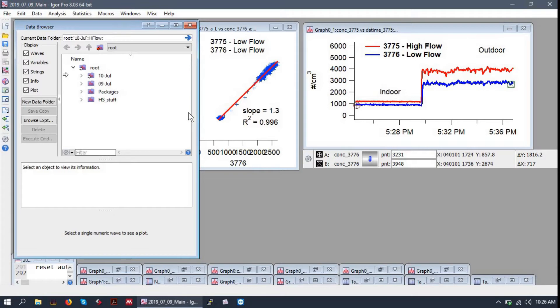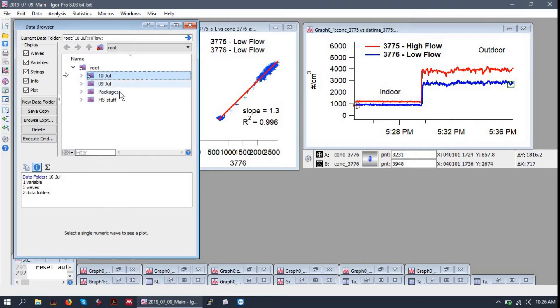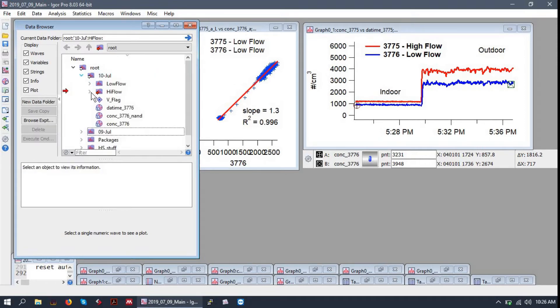We have our data browser, which is where all of our data can be seen and organized. I am a bit surprised at how organized mine is, actually, but I like it.